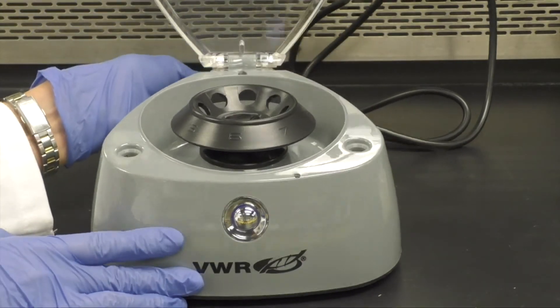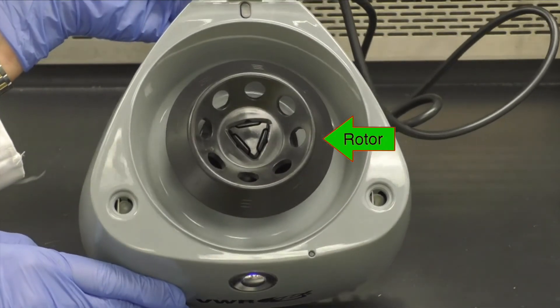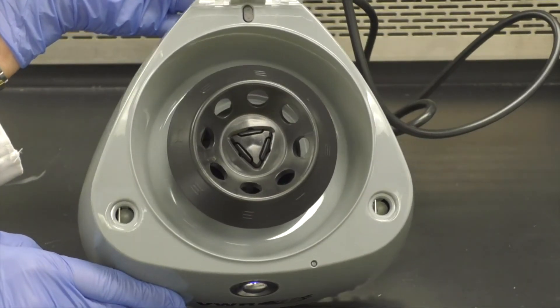As you look into the mini centrifuge, you will see a rotor with 6 holes. When you use a centrifuge, you must balance your sample by placing another balance tube, in this case the one you filled with water, directly across from your sample.